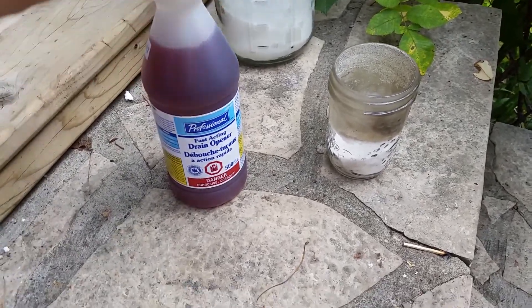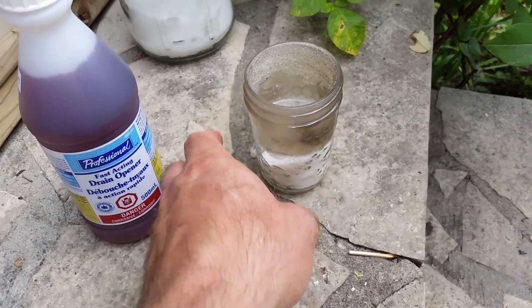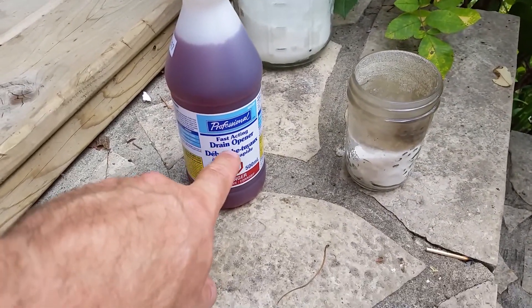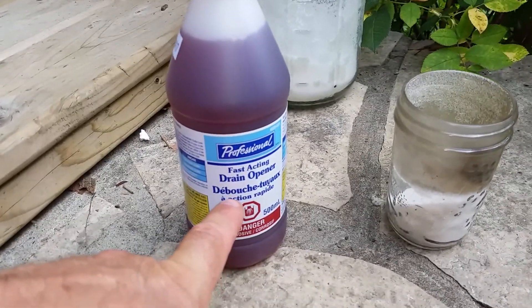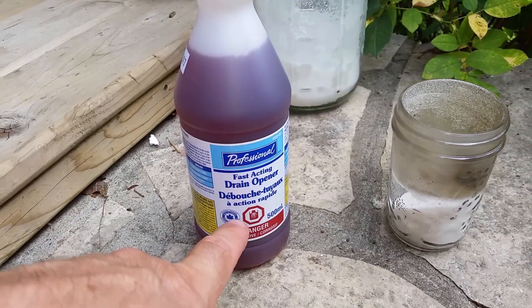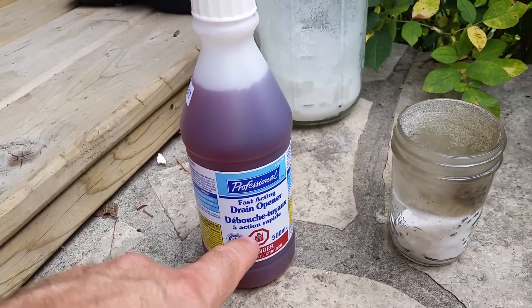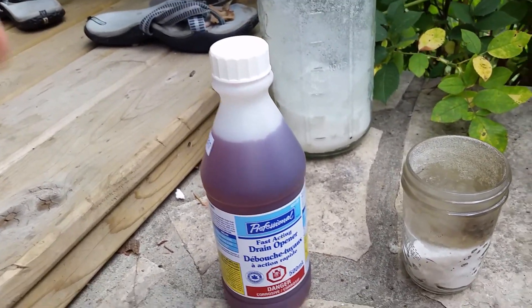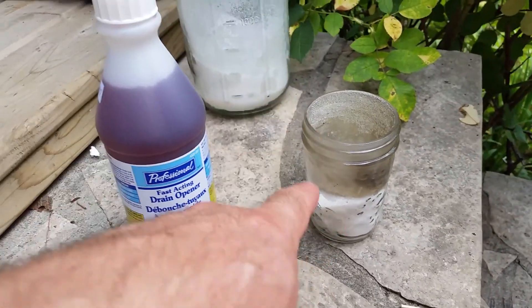My son has been bugging me about this today. We've already done a few experiments — he wants to burn sugar. We did some more research, and you need some sulfuric acid. This is really nasty drain opener. Very, very nasty stuff. If you read up on this stuff, this is really nasty — don't mess around with it.